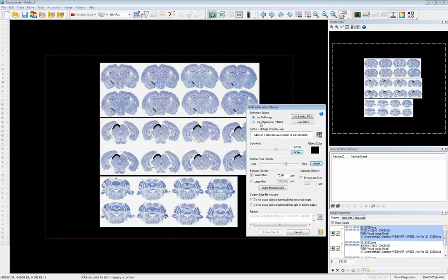So the way this tool works is by growing clusters of pixels of similar color, representing detected objects ultimately. By adjusting parameters for the detections, in most cases it is possible to get high quality results that are reproducible by saving them down here. This little button has a file cabinet icon, and you can save different parameter sets that work on different types of tissue.